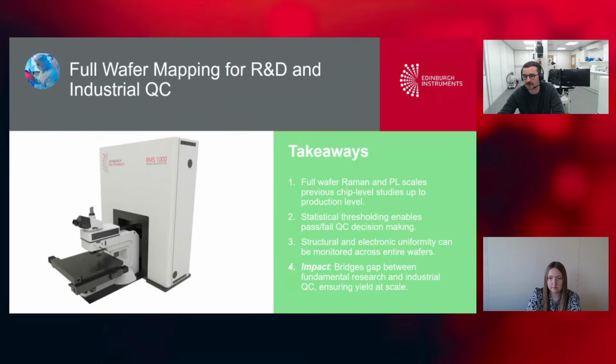And before we get on to the webinar conclusion, I don't know if you have any questions about the wafer, Angela. Just for setting those tolerance levels, how do you go about knowing them? Is it sort of industry standards, a case of reviewing literature? Does it vary from the end goal of the wafer as well? I imagine that when setting up a Raman microscope in a fab, the user would have a large number of wafers that they know are very good through other techniques. So I guess it would be building up a statistical data set of Raman and PL signatures that are good, uniform, and making the tolerances from that.